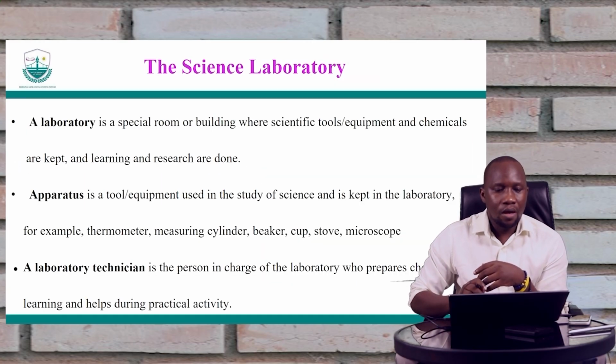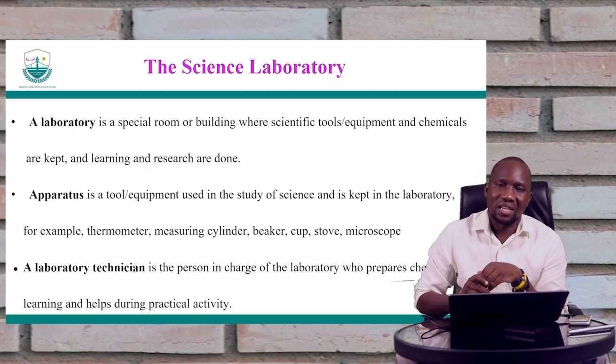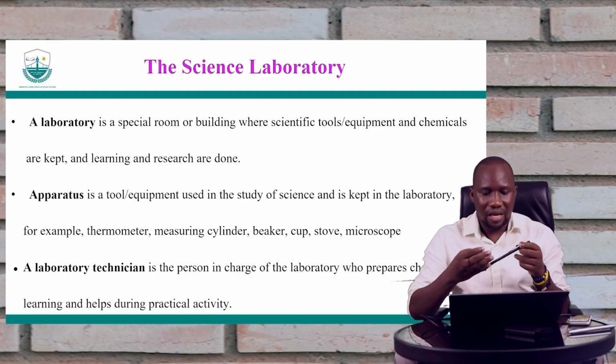So the laboratory is basically any room just like this, where you find laboratory equipment, or what we call laboratory apparatus, the tools that we use in carrying out experiments. So the ones we call the laboratory apparatus. You can use the word apparatus alone, and it is actually enough.